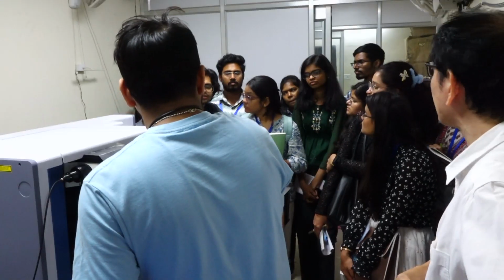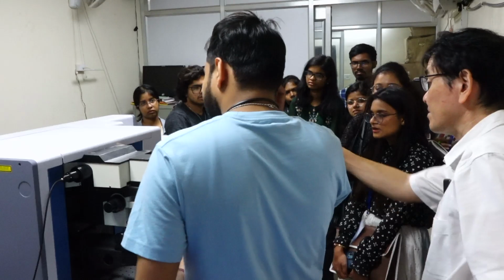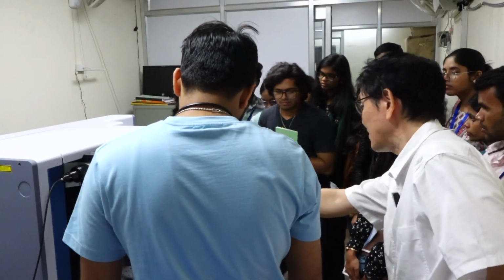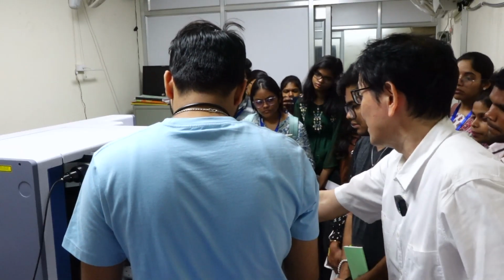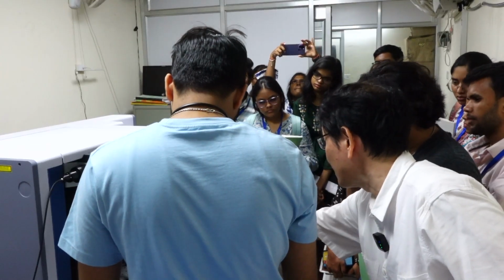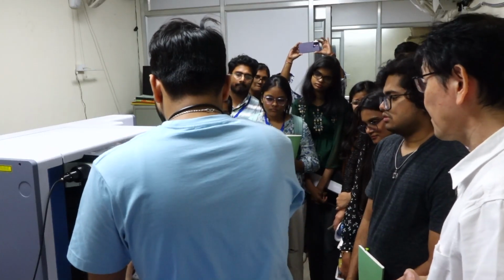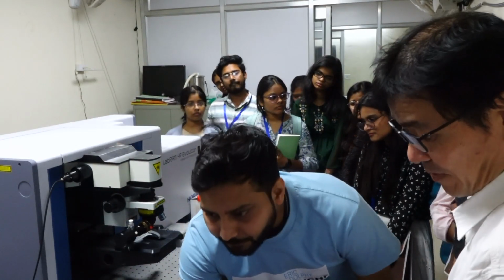Sir, can you explain again what that thing is? So this is an attachment. Light typically passes through the microscope objective and focuses on a small spot. But this is not a microscope objective. Light is transferred to the left to irradiate. There must be a mirror. There is a mirror. This is a typical Raman measurement.